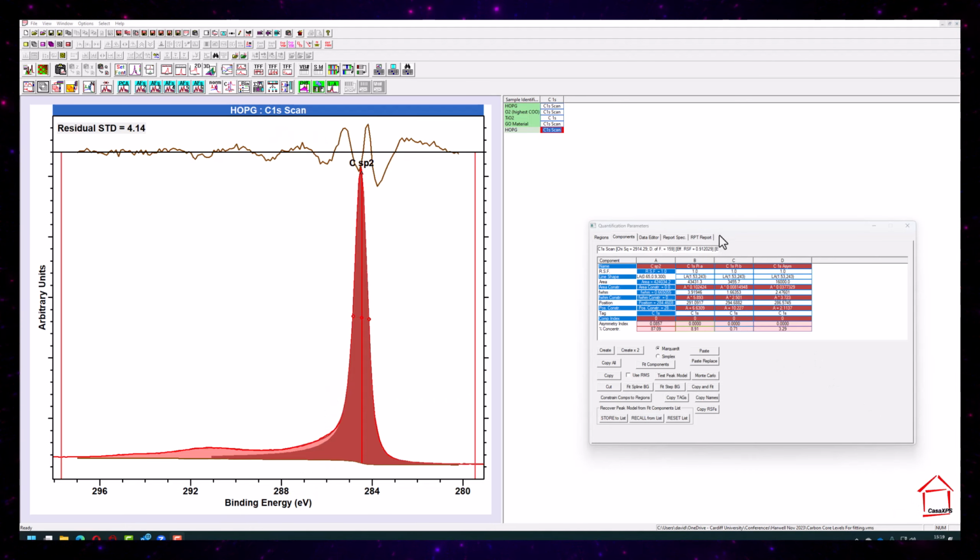Okay, so going forward, that is probably the most difficult type of example that you will have there. What I want you to now do is play around with making your own line shapes, see how they form, and whether they reflect the data. It's perhaps valid if you can do a constrained model.